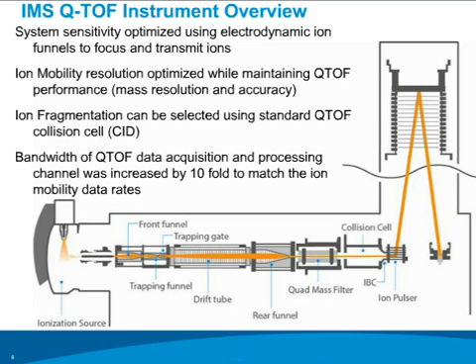We can control the ion fragmentation. We can turn it on or turn it off depending on the experimental results you want to obtain. And when we turn off the fragmentation, we can maintain a very low heating of the ions so we don't unintentionally fragment or change conformational structures.